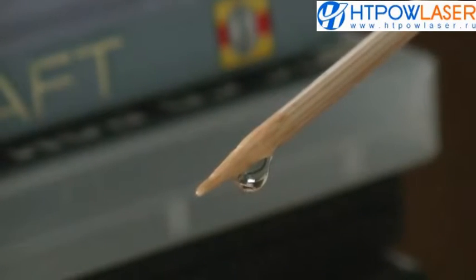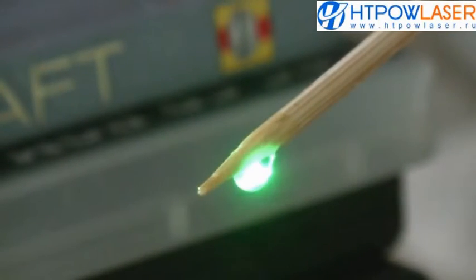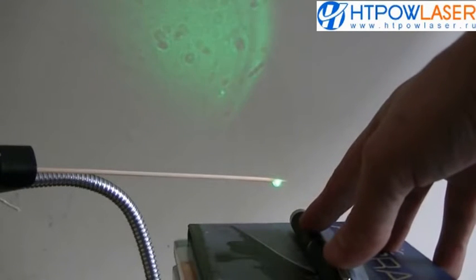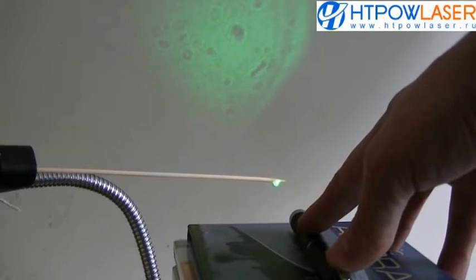Now that I've carefully suspended the sample, I'm going to shine a laser through it, and the microscopic image should appear on my wall. There we go. Let's take a closer look.